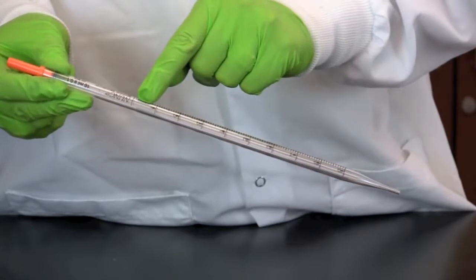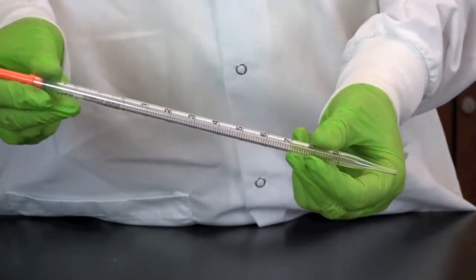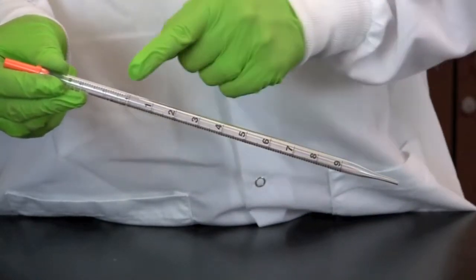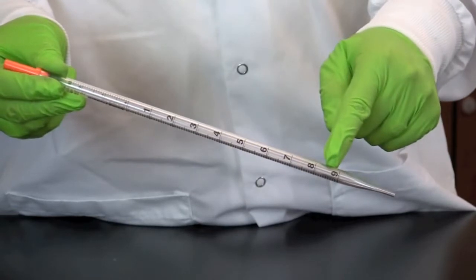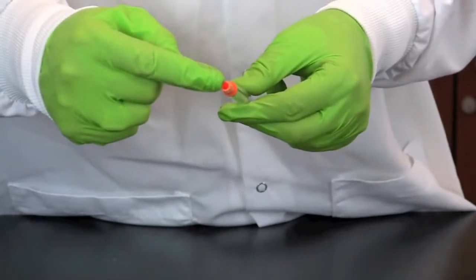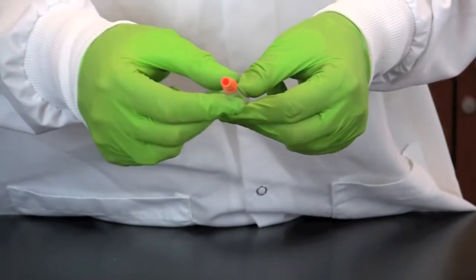Serological pipettes have two scales, one for filling and on the other side one for dispensing. They often have a cotton plug in one end to prevent contaminants from being drawn into the vacuum source.